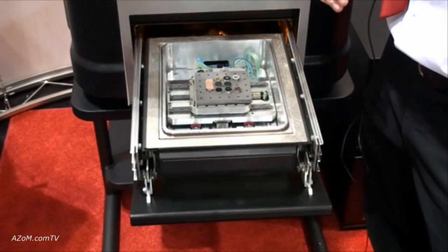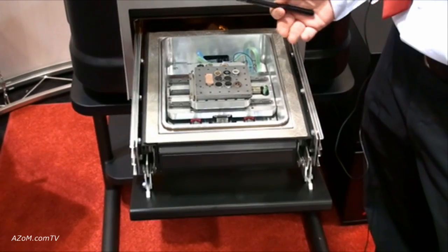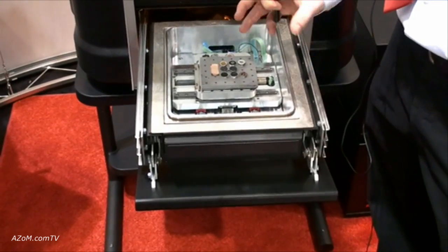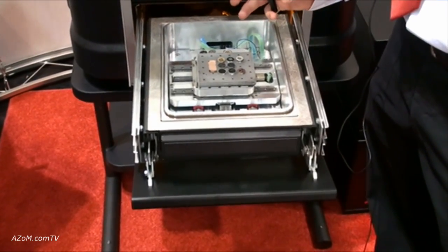Now we'll talk about the PSIM Express sample interchange. It's very unique in the sense that we have 80 by 100 millimeters of X and Y travel in the stage chamber here — a relatively large chamber.